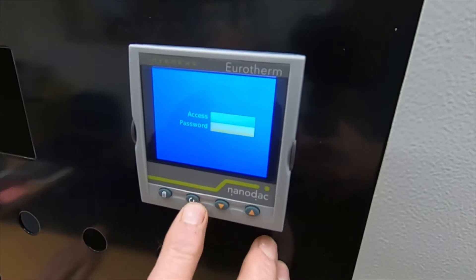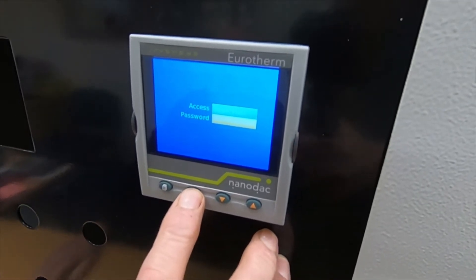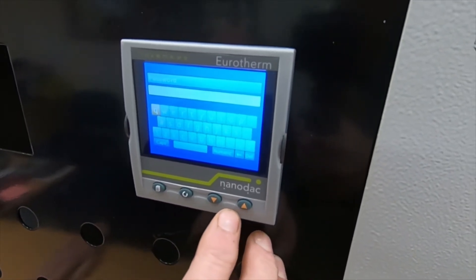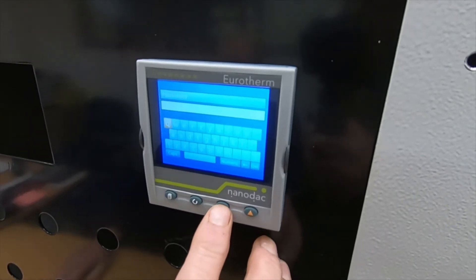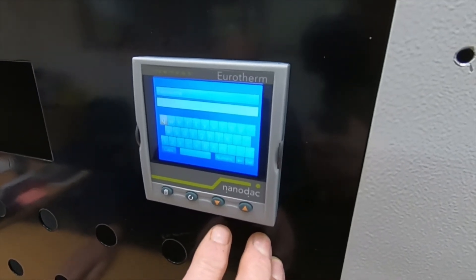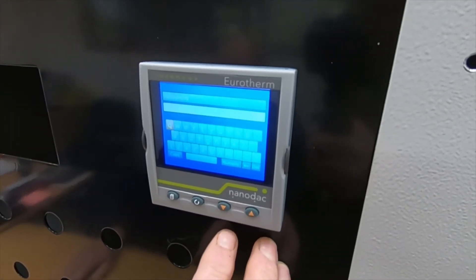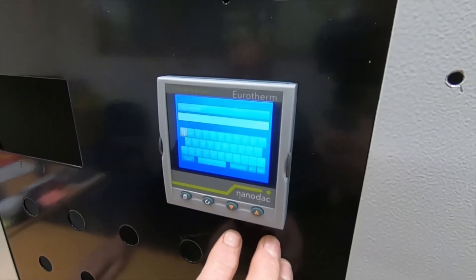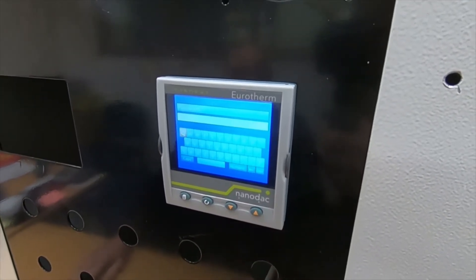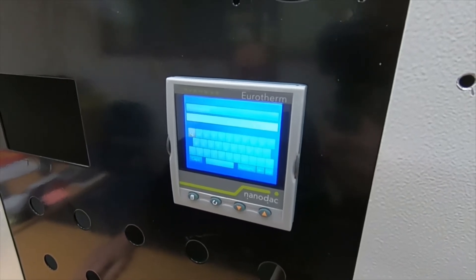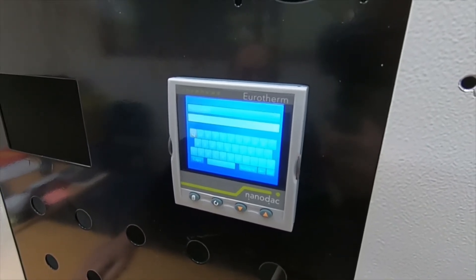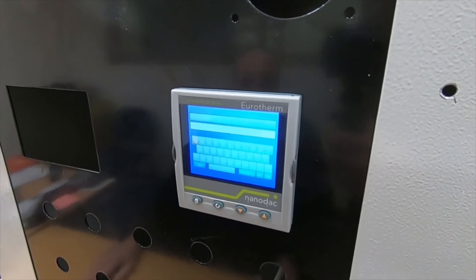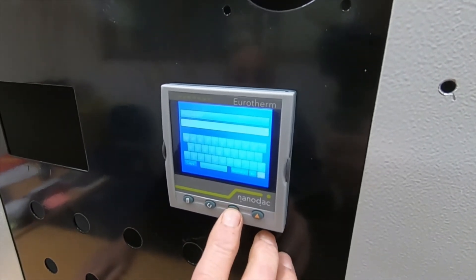Press the scroll button again and then again. At this stage we're going to put the password in, and there are two or three possible passwords depending on the instrument. On the older instruments it's numeric — either 100 or 101. We'll demonstrate those two and then go to the code on the newer ones.